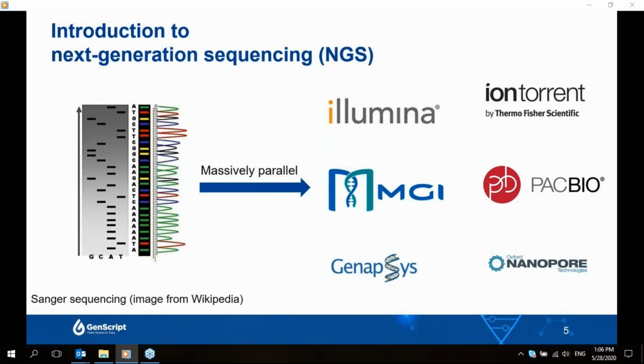But among all the sequencing instrument providers, Illumina is the dominant player and the most widely used one. For the sake of today's presentation, I will focus on Illumina's platforms, and also for simplicity, unless I point out otherwise, all my examples will refer to the human genome and the human DNA. The same principle and examples, though, should apply to all genomes and to all organisms.